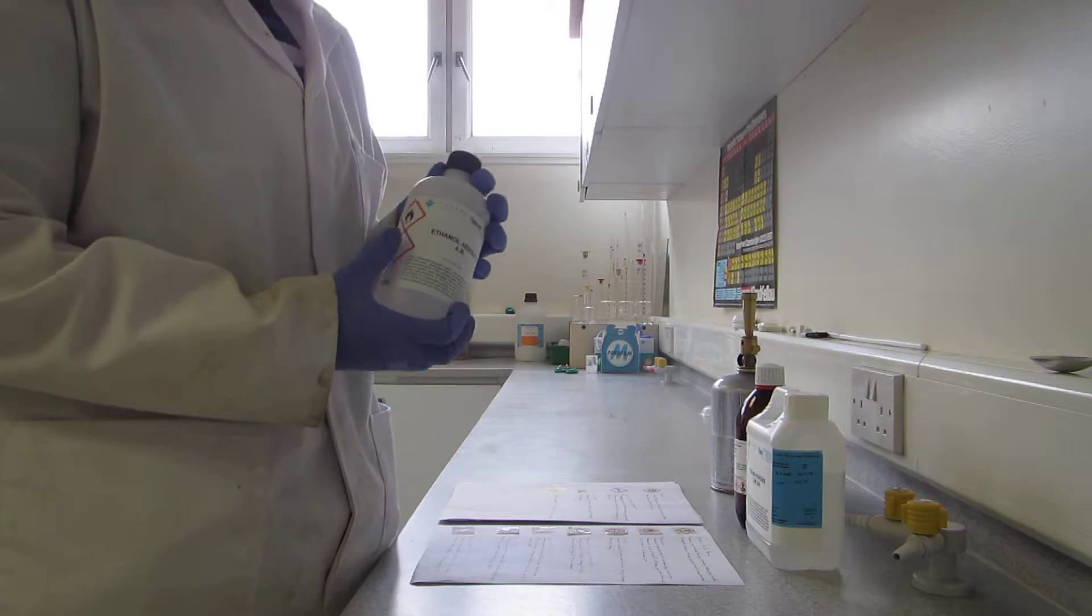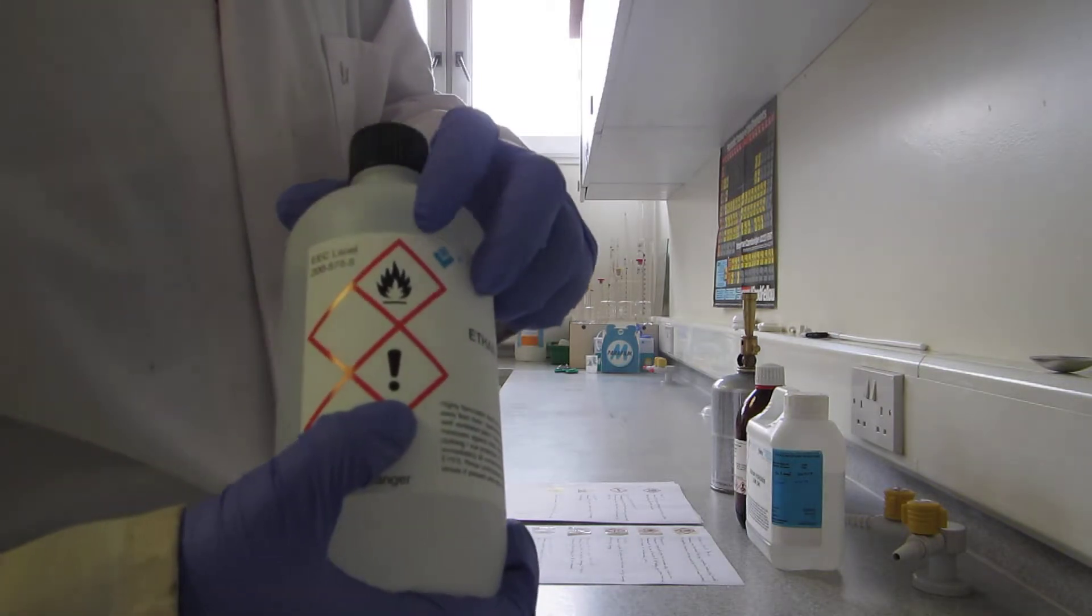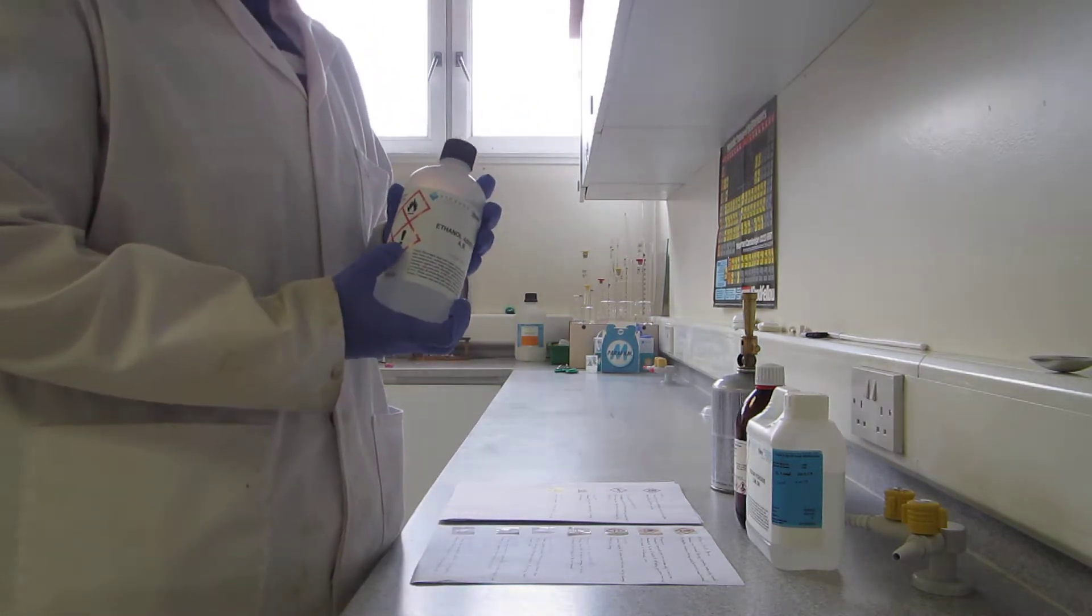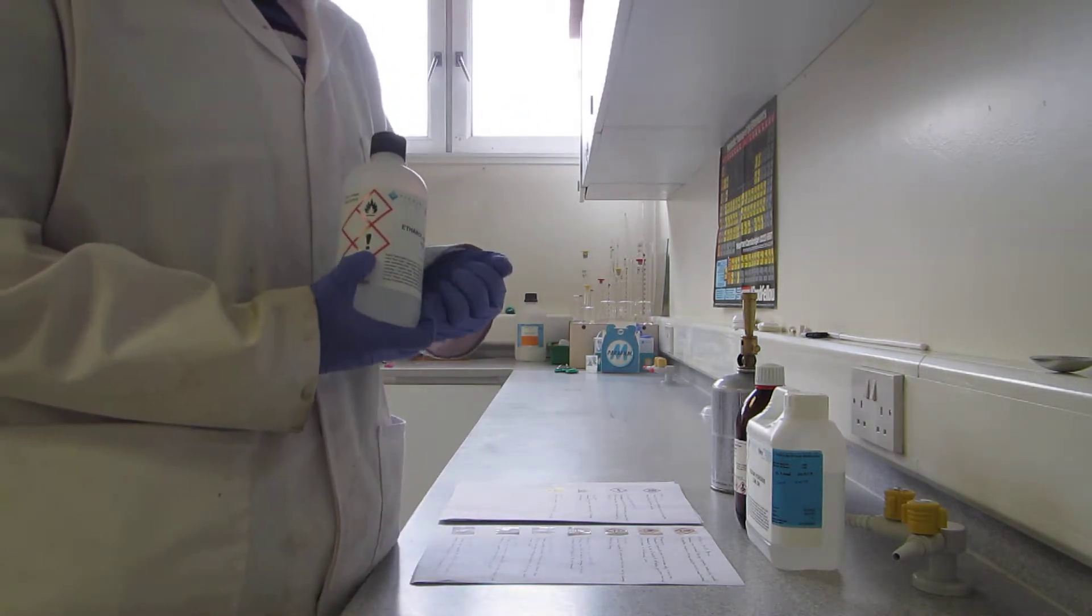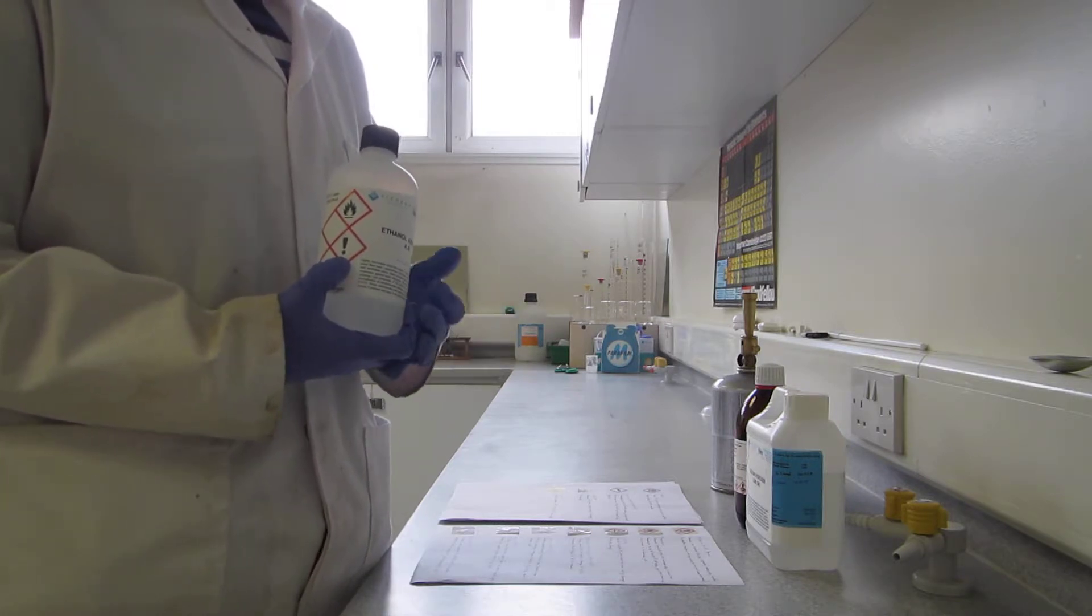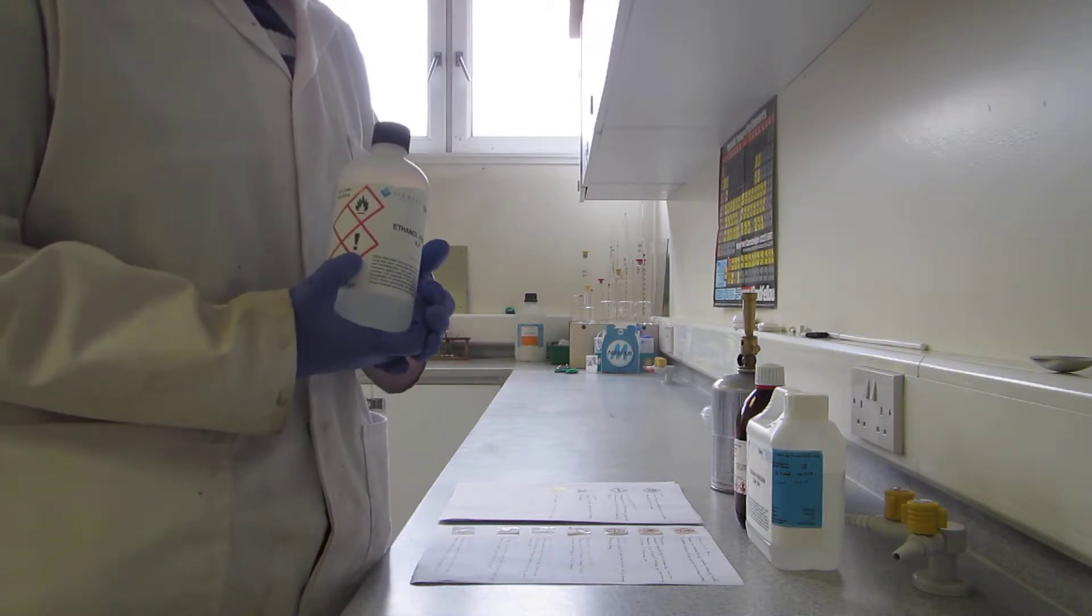The next symbol is this exclamation mark, which means that it's a moderate health hazard. This can be on a chemical because it is an irritant, either to the skin, the eye, or the respiratory system, or it may be harmful if you ingest it, inhale it, or it comes into contact with your skin or eyes.